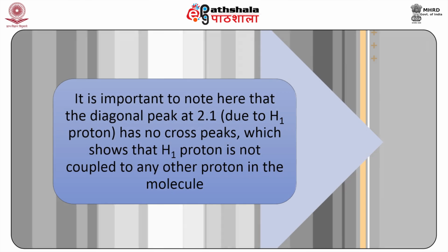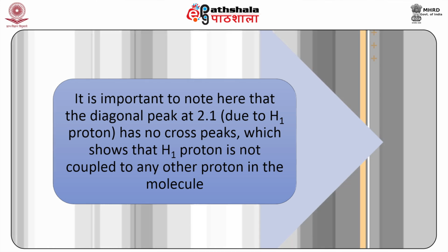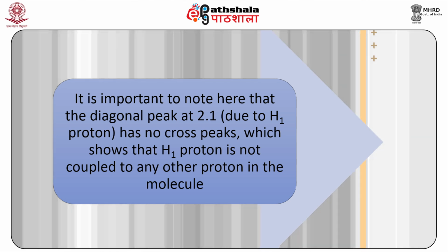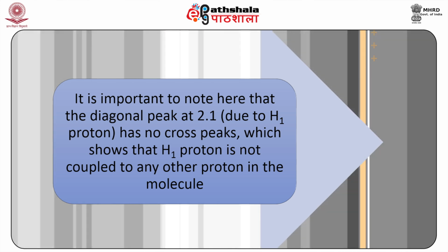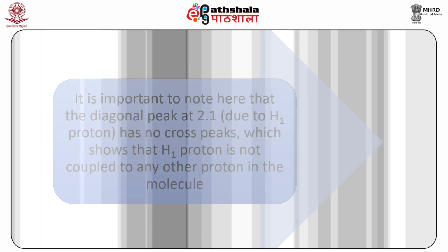Now it is important, students, to note here that the diagonal peak at 2.1 due to H1 proton has no cross peaks on the other side, which shows that H1 proton is not coupled to any other proton in the molecule. Now I hope from this correlation spectroscopy you can understand the influence of coupling and the importance of coupling in a particular molecule.